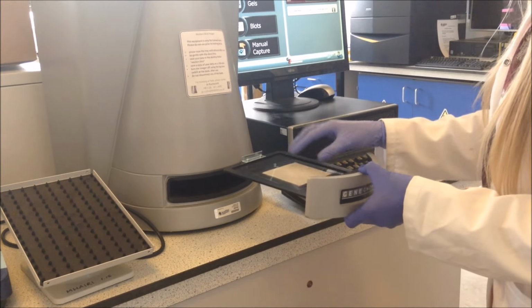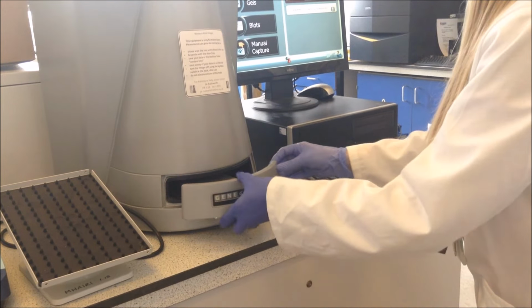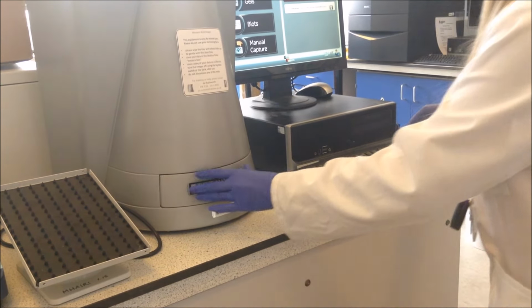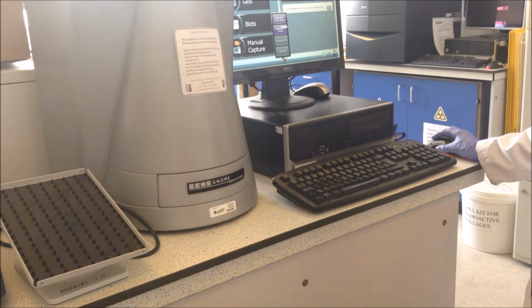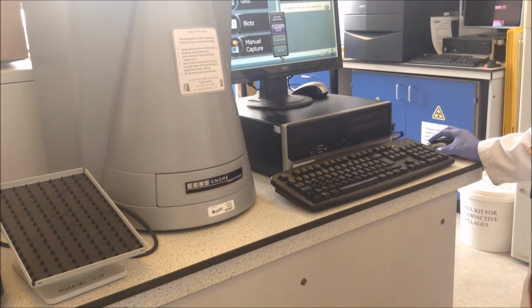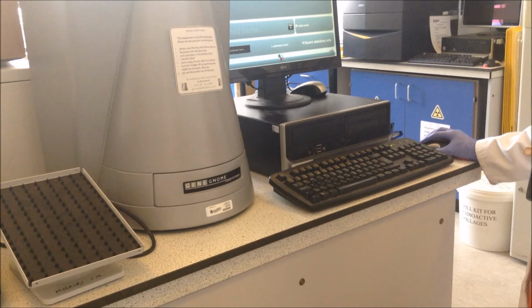Your membrane is now ready to be analysed, so open up the blotting reader and place your membrane onto the slot, and then reinsert it back into the reader. So depending on what blot reader you are using depends on what settings you need to use. However, for this one, all we need to do is switch it onto Western blot and it should be able to read it.